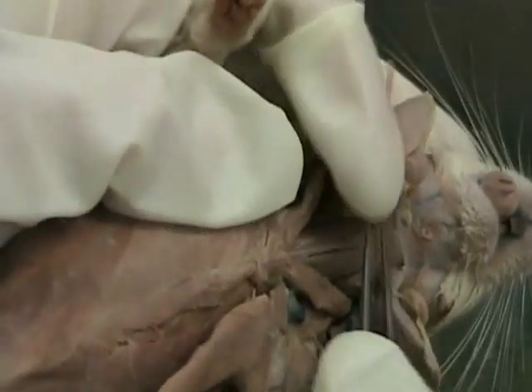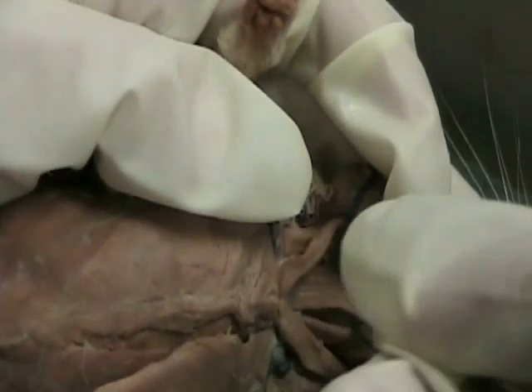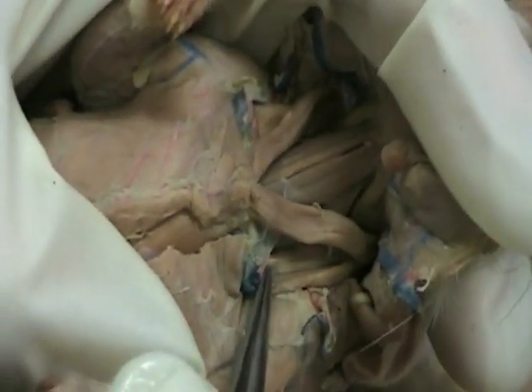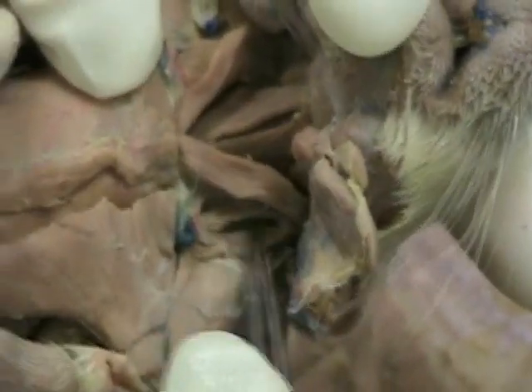sternohyoids. Here's a better image of the digastrics underneath there. If you move these sternohyoids to the side, you should find the trachea underneath. Okay. Now, for the deeper neck muscles, you look carefully for the cleidocervicalis right here, and it actually splits into two. It starts with the clavicle, but it's going to end with the mastoid. So we call it cleidomastoid. Okay? You should find it over here also. If we cleaned up in here a little bit, you'd find the same exact thing over there.